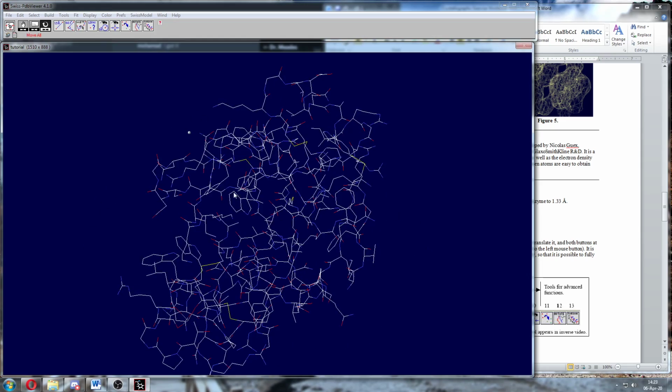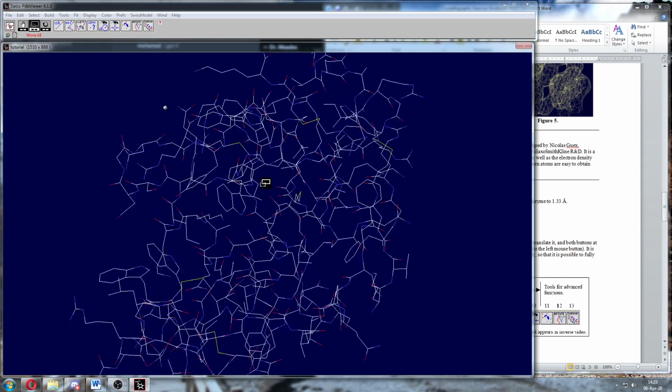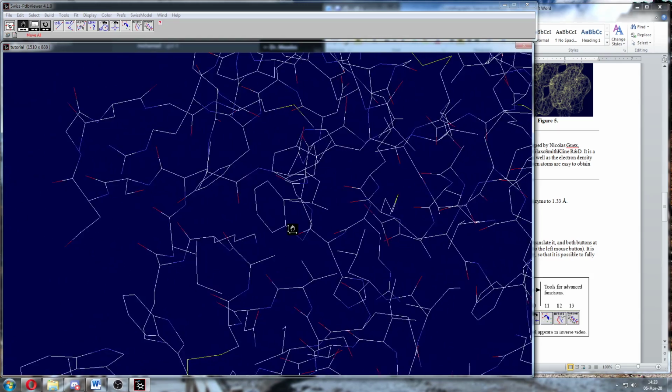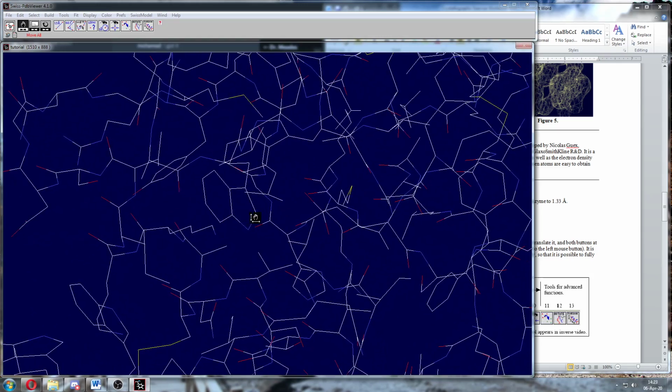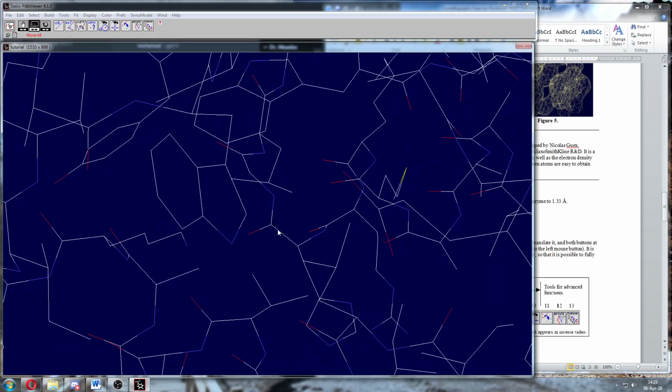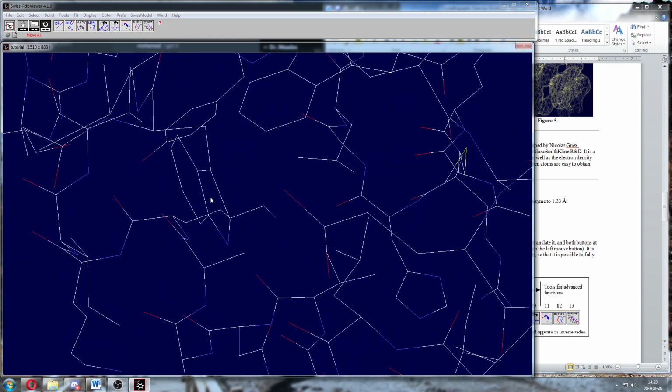I can rotate, I can zoom in, move, say, molecule left or right, and you should notice that I found a tryptophan residue right here in the center of the screen. So I'd like to center on that tryptophan, get it in my view. So I'm going to zoom in a little more. Right? You notice it is 3D. So I rotate it a little.